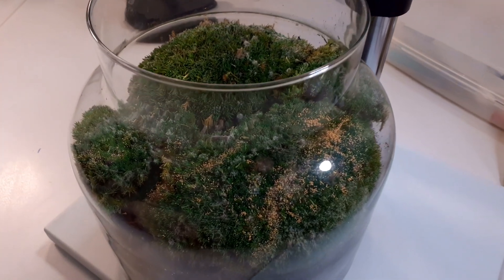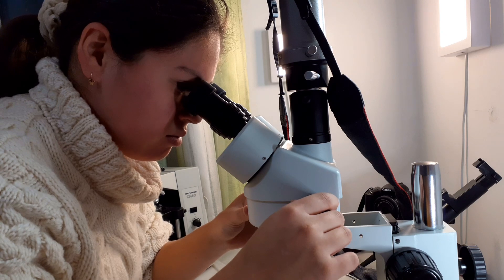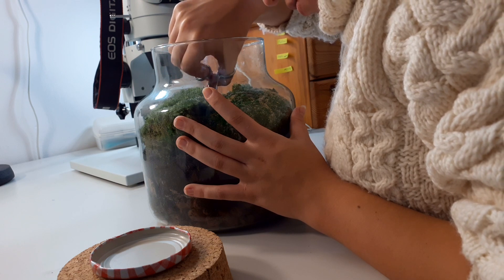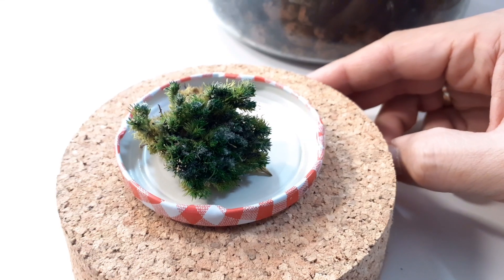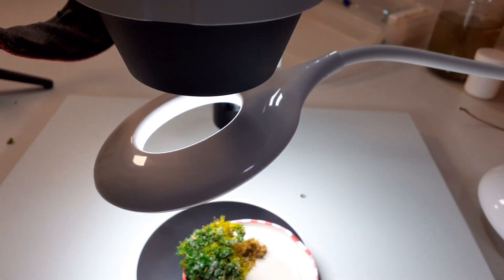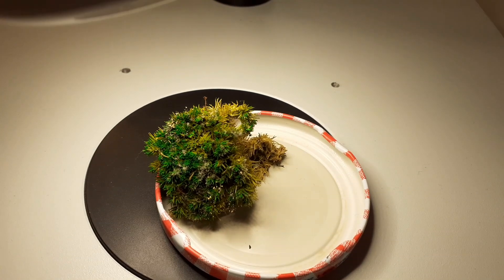I want to have now a closer look at the fungus that I see here. Isabella is now using the zoom function of the microscope, but we found it much easier to actually remove a sample and look at it separately because we simply have a little bit more freedom of moving the specimen around. When I put it under the microscope with a desk lamp to illuminate everything properly, this is what we saw — the green thing is the moss, and growing on the moss, all of this gray stuff is the fungus. The yellow dots now appear much larger — I think these are indeed structures that form the spores.